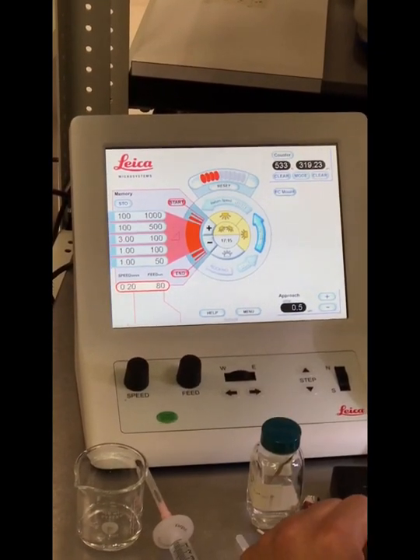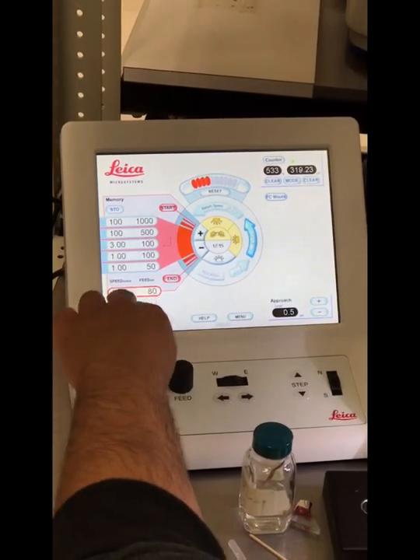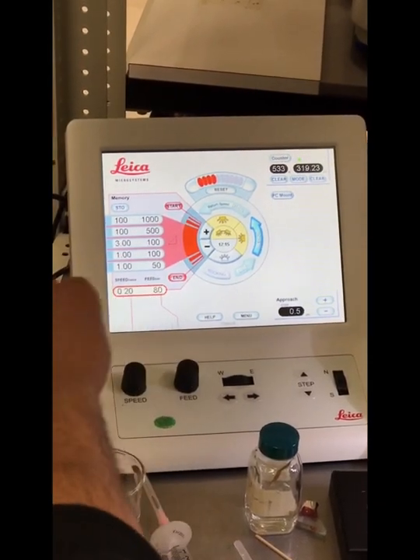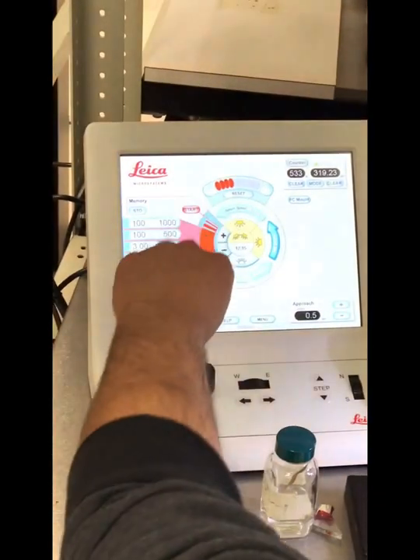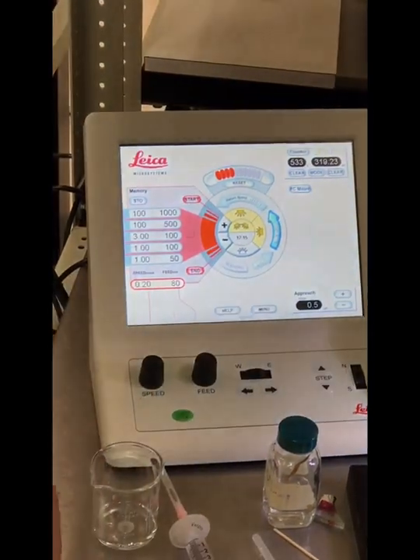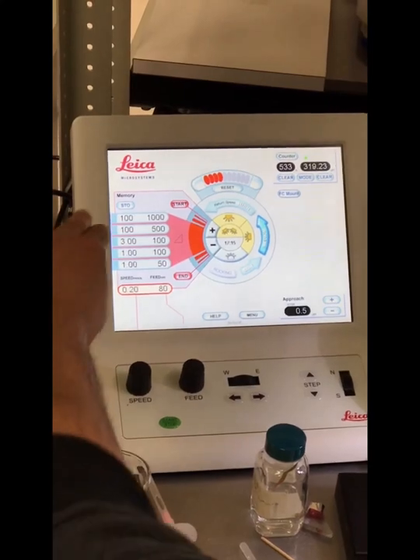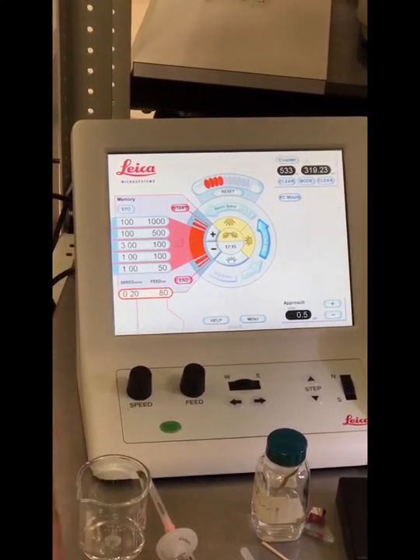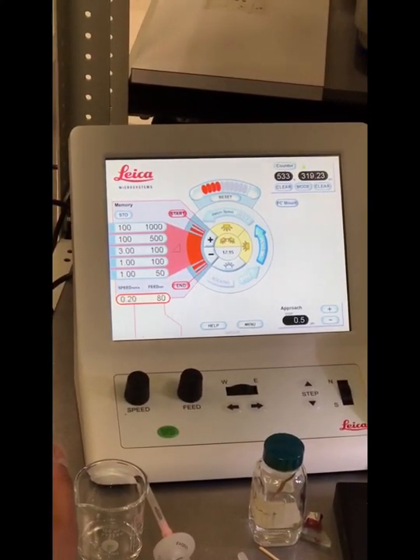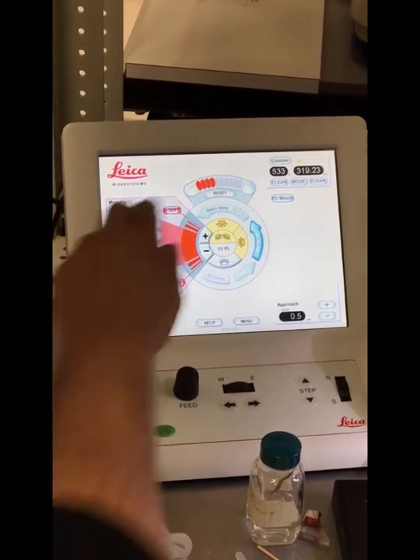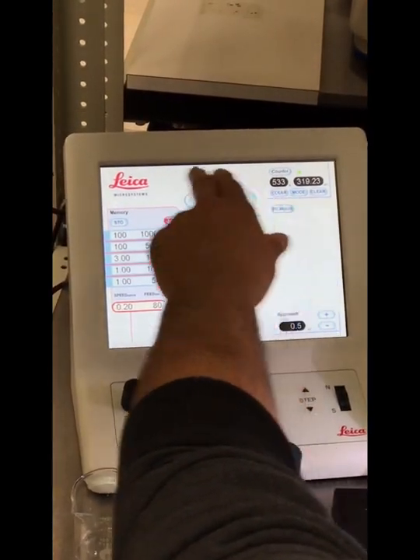The active speed feed value is going to be right here. And the cutting window setting, start and end there. The speed and feed memory setting is going to be here. The total specimen advance indication is going to be this up here.